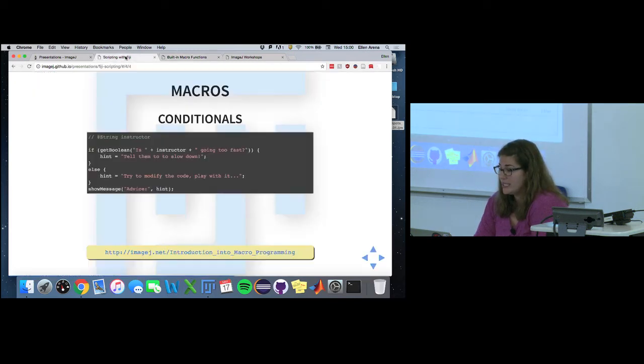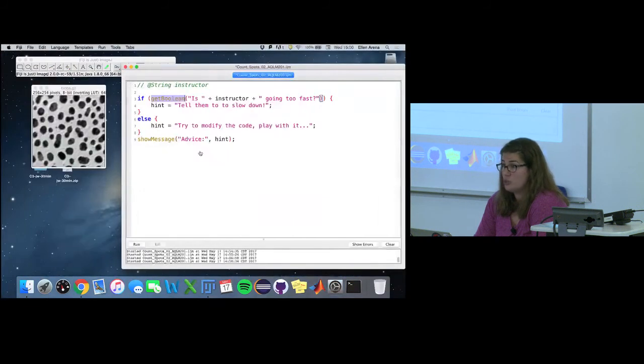So what this is doing is, if this condition is true, it's going to do the code that's within this block, within these brackets. But if it's not true, if what's up here is false, so this is the if-else statement, then instead of doing this code, it will do this bottom set of code. Okay?